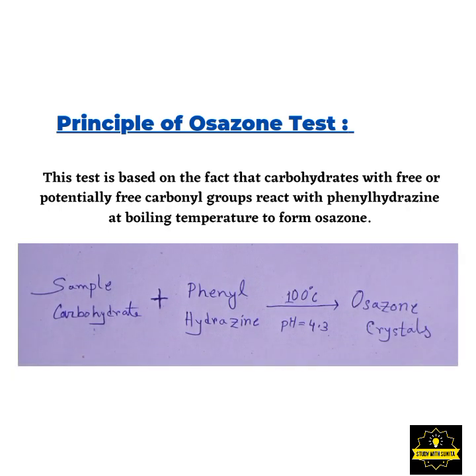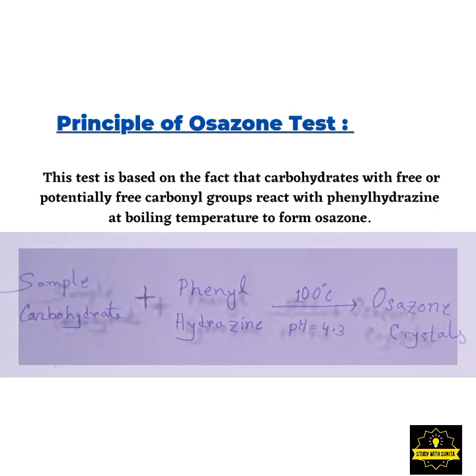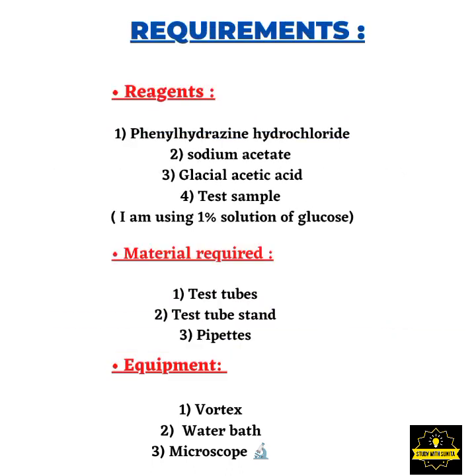Now we will know the principle of the Osazone test. This test is based on the fact that carbohydrates with free or potentially free carbonyl groups react with phenylhydrazine at boiling temperature to form Osazone. The requirements are given below.